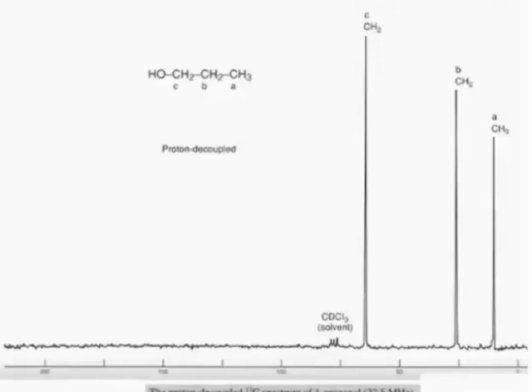And as a result, when one does a C13 NMR, you do not carry out peak integration because it wouldn't give you any information. One has to just accept the fact that peak size no longer has a relationship to the number of carbons producing it. That information becomes lost because the decoupling is carried out.